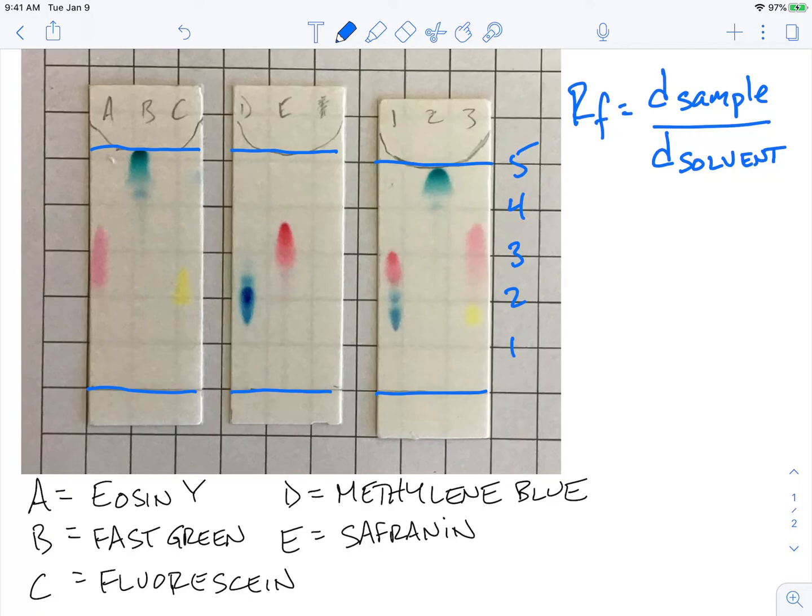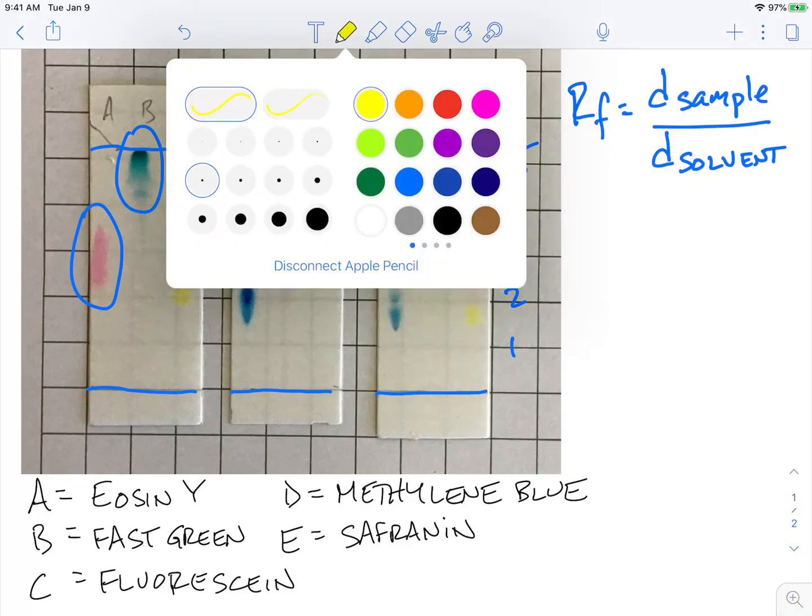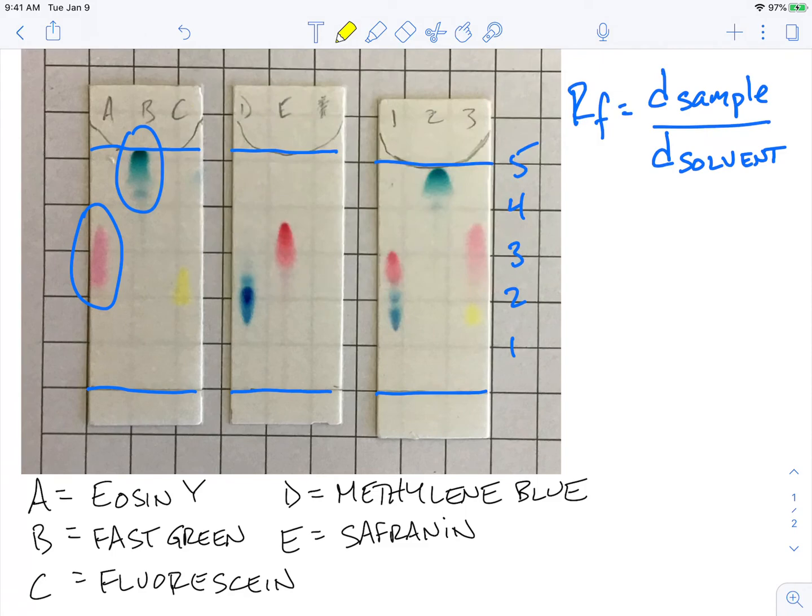When I'm looking at, for instance, to calculate the RF value of sample A, it gets a little bit tricky. And the reason being is that everything is sort of spread out really evenly. If we compare that to sample B here, the fast green, the fast green has a darker area. So typically what you would do is that you would take that darkest area and then you would measure and you'd maybe sort of put your point in the middle to measure your distance and how far it traveled.